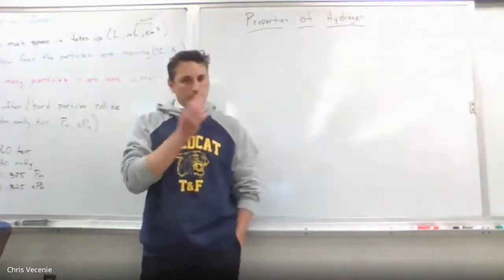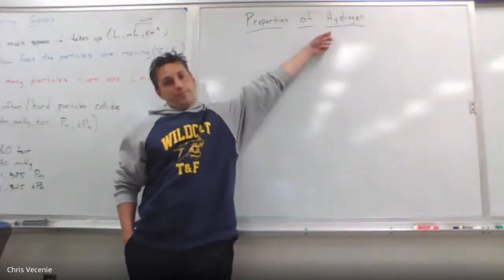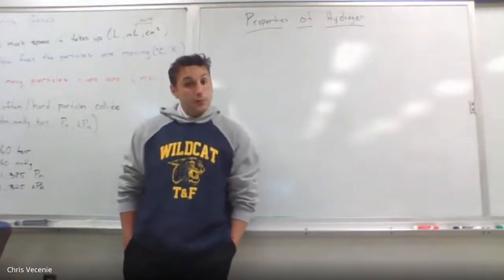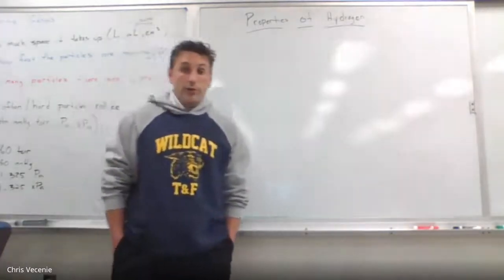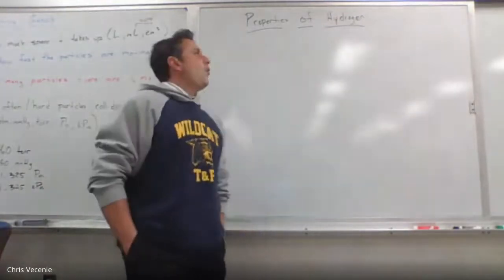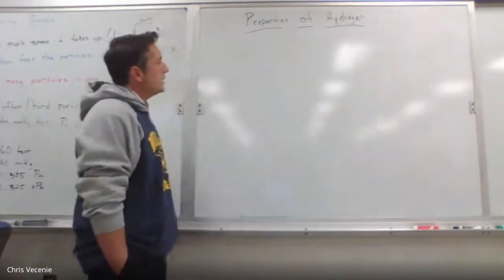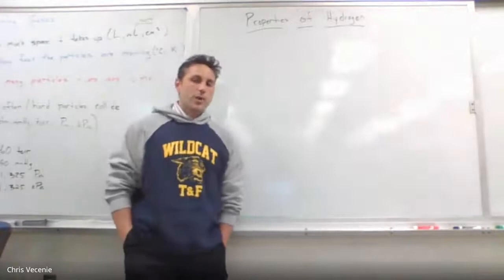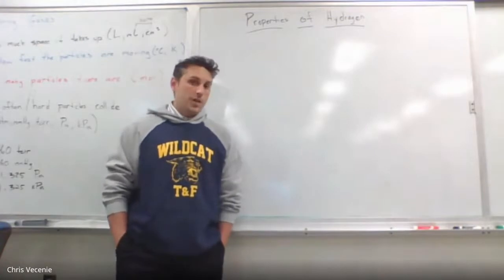Heading back into the lab today, the idea behind this lab is that we're trying to connect two separate ideas. Last week, we tested the properties of a gas. It was oxygen. We were checking for things like fluidity and expansion and diffusion. In concluding that lab, hopefully you realize that oxygen did all of those things. What we want to see today is if I change the identity of a gas from oxygen to hydrogen, does it affect any of those properties? Does every single gas that we study possess the same characteristics?